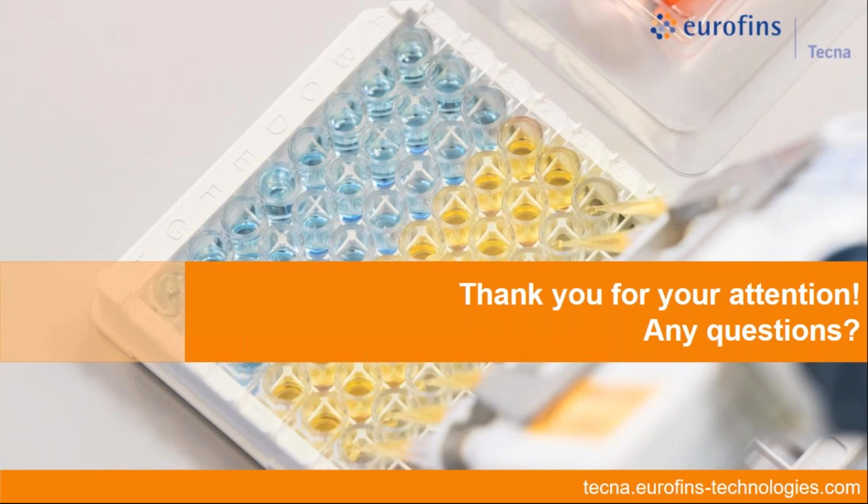Then there's another more technical question, I think. For washing of plates, can the automatic washer be used? We recommend not to do so. We use an easier solution, that is the squeeze bottle. And it is a general recommendation for all our ELISA test kits. It is more powerful than the automatic washer. Don't be scared about any cross-contamination of wells. It doesn't happen. So just prepare your washing buffer, put it into the squeezable bottle, and perform your washing procedure with your hands. It is more powerful and creates a real vortex inside the well.